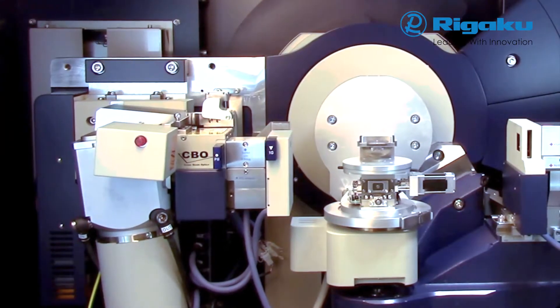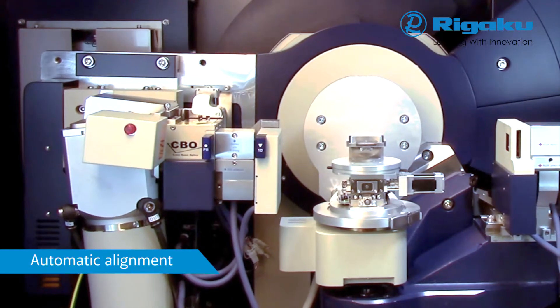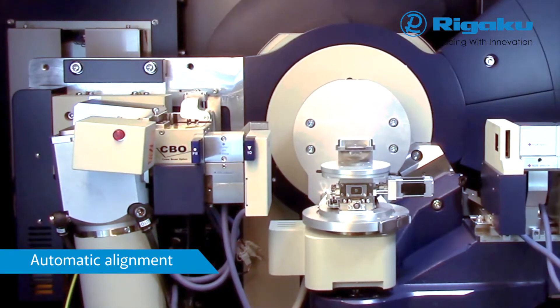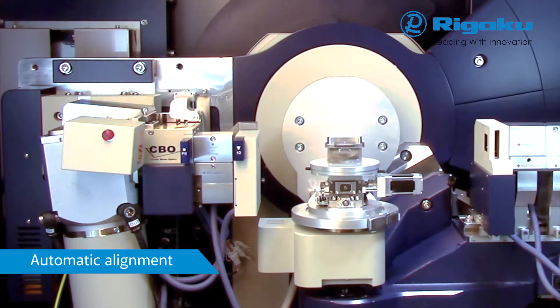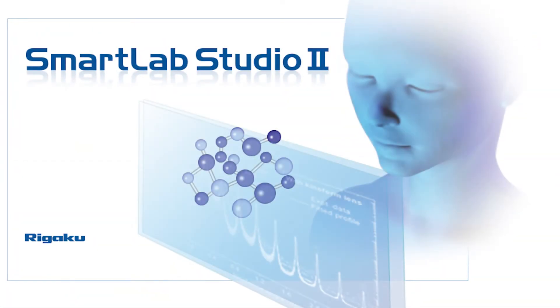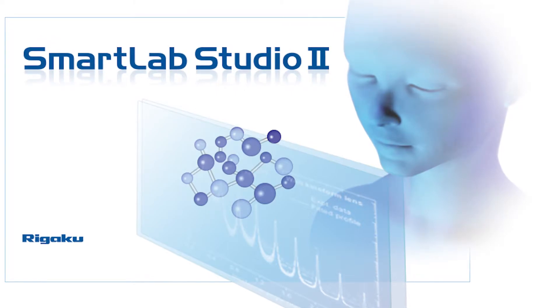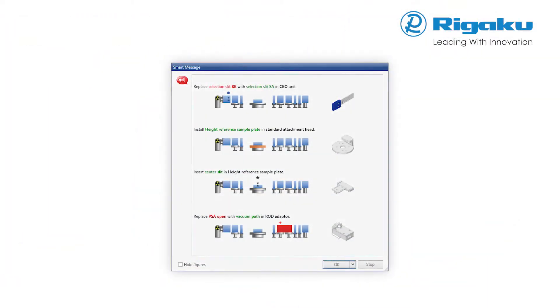Optical alignment, including Bragg angle alignment of multi-layer mirror and monochromator, centre of slits and detector centre, are done by the SmartLab guidance software. This eliminates manual alignment, maximises uptime and minimises cost of ownership.